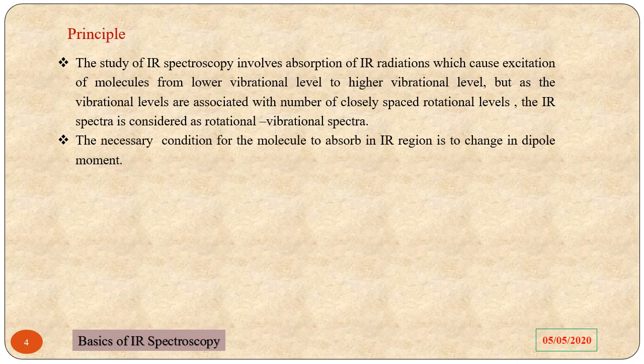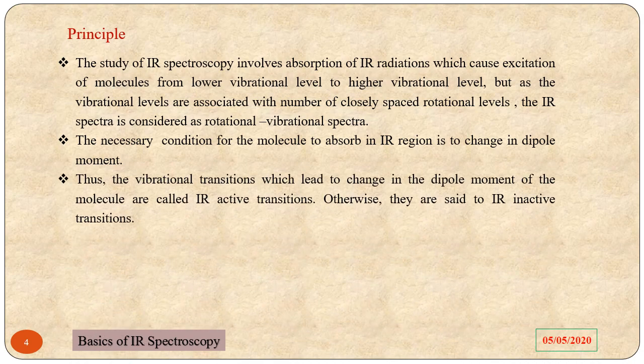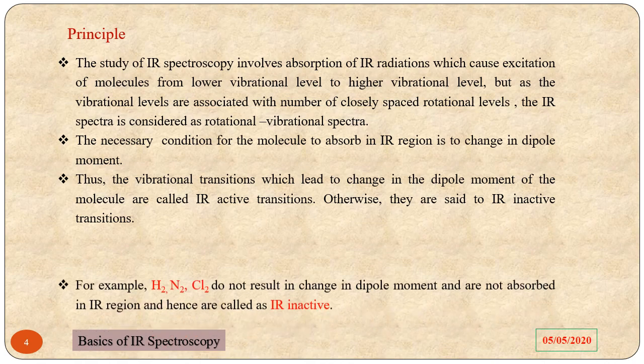Now, the necessary condition for the molecule to absorb in the IR region, that is infrared region, is to change the dipole moment. Thus, the vibrational transitions which lead to a change in the dipole moment of the molecule are called IR active transitions, otherwise they are said to be IR inactive transitions.